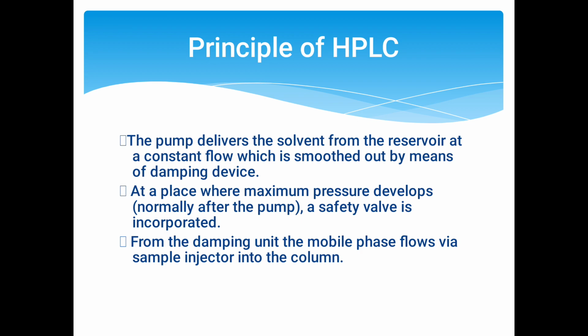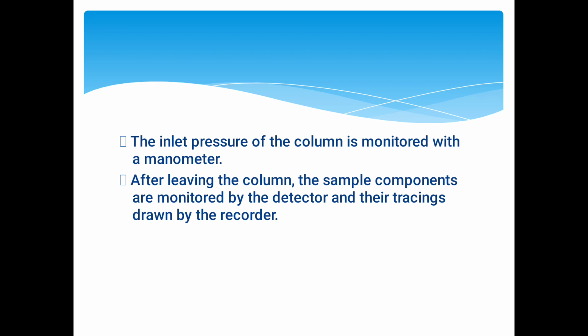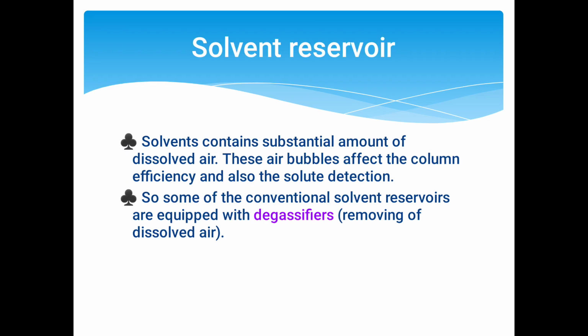Principles of HPLC. The pump delivers the solvent from the reservoir at a constant flow rate, which is smoothed out by means of the damping device. At the place where the maximum pressure develops, a safety valve is incorporated. The inlet pressure of the column is monitored with a manometer. After leaving the column, the sample components are monitored by the detector and their tracings are drawn by the recorder.